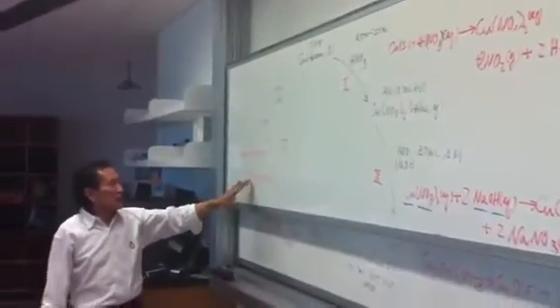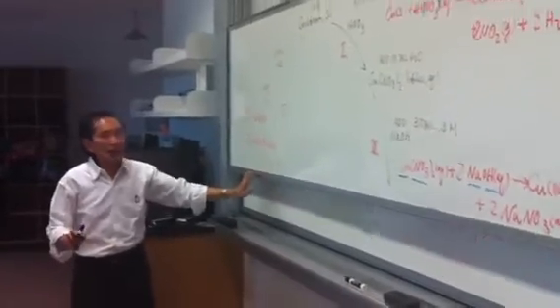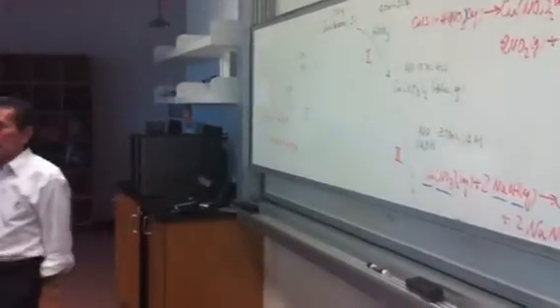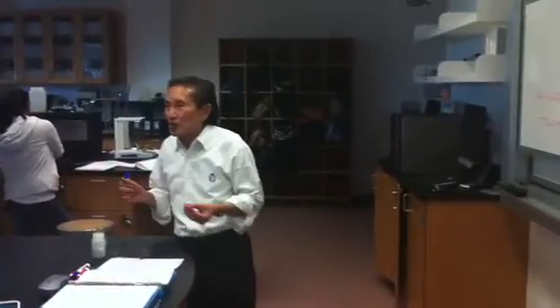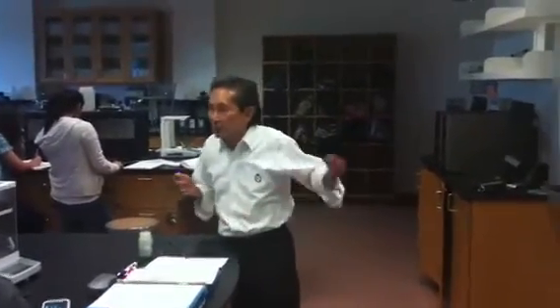So now copper settles out. You measure approximately 2 grams of zinc. But how do you know that 2 grams will be consumed entirely by this reaction?